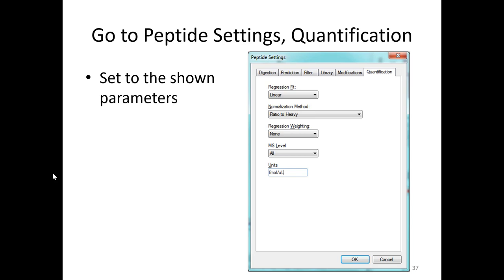If you go to view, and then arrange graphs. Yep, right click in there, and then circle graph. Hey, Brendan, how do you unsplit your view? I don't normally use split view, so how do you transition?